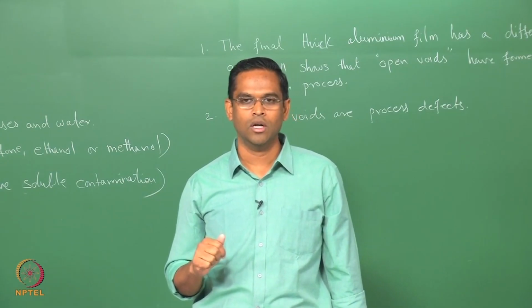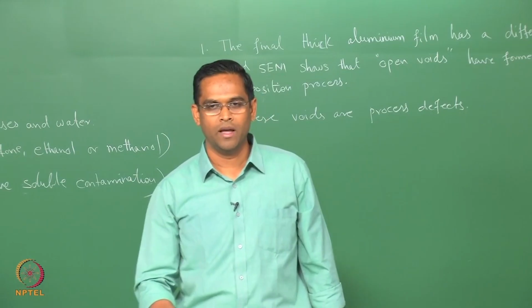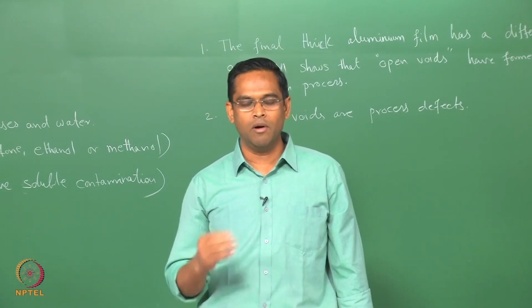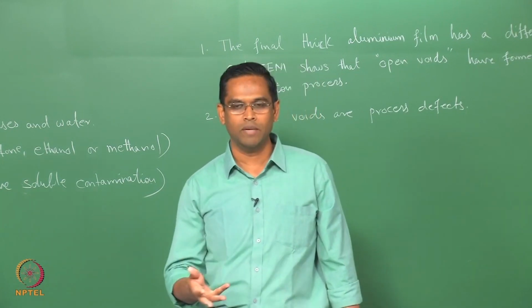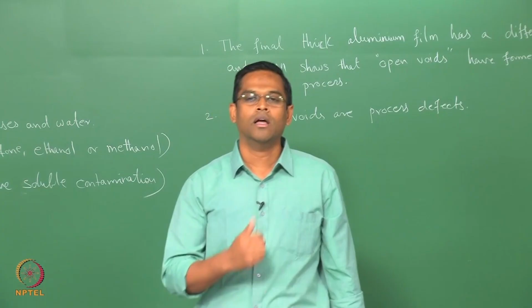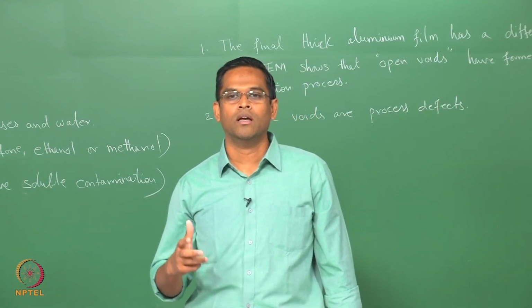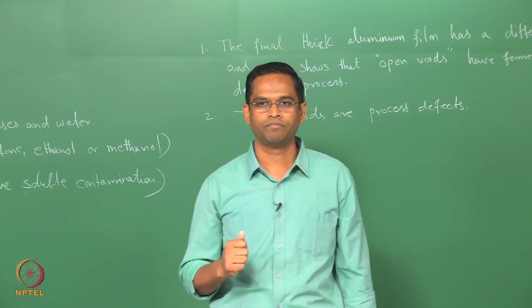That is another issue. A similar point can be made on the calcium peak observation. The same argument applies: it could be a segregation, or the quantity of calcium on the grain boundary may be higher than inside the grain. So, that is another way of looking at this spectrum and how to interpret those.